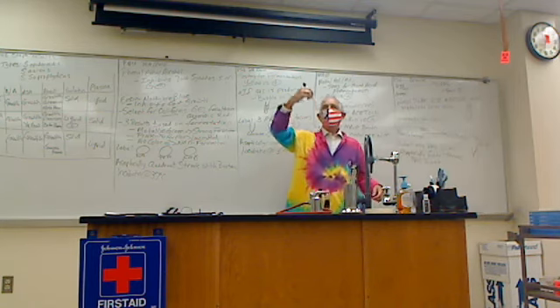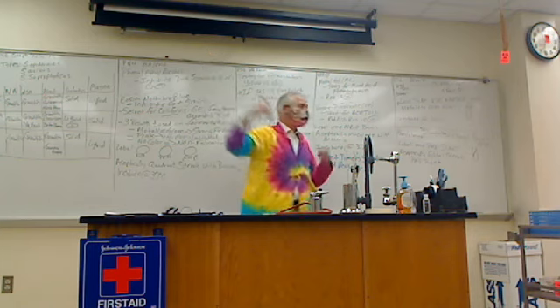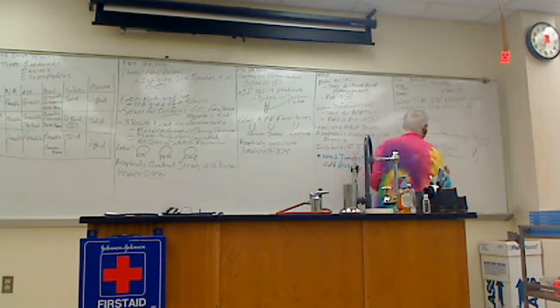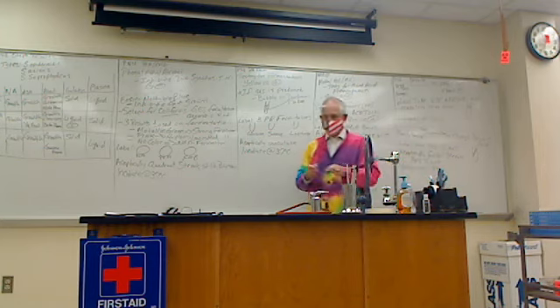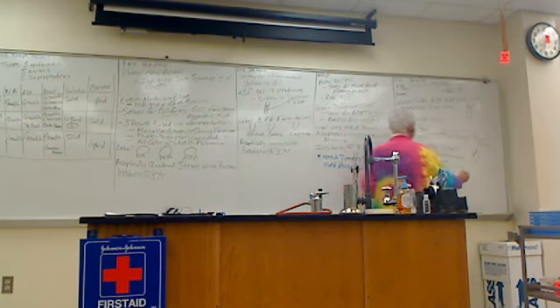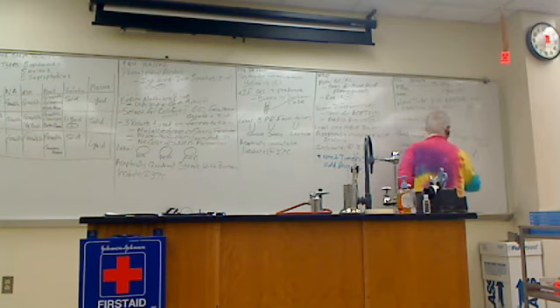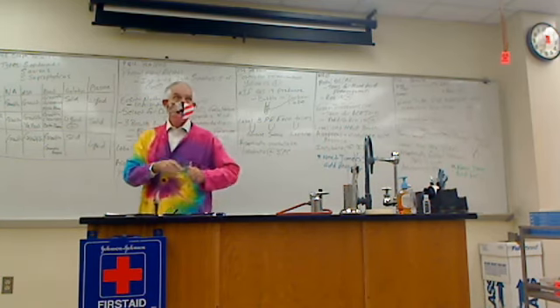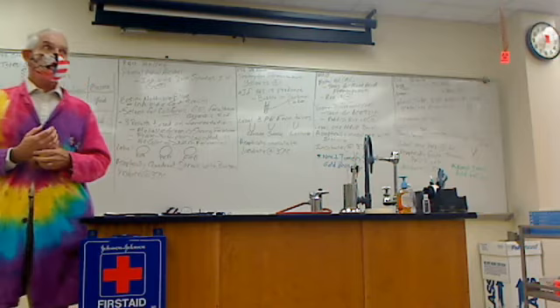So basically that, you zigzag it going up, and then incubate at 37 degrees C. And then next time, you're going to add iron chloride.